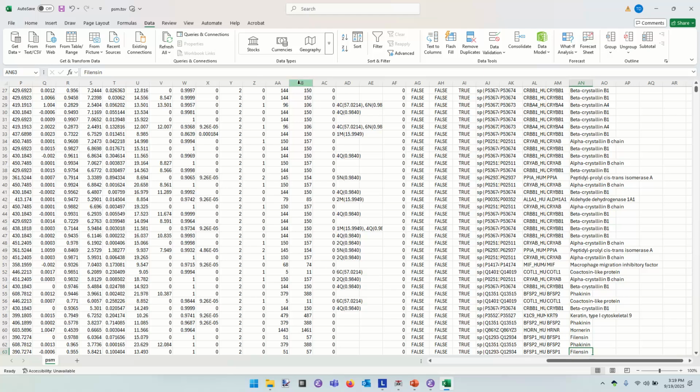Occasionally, it's good to use bog standard tools like FragPipe for doing basic sanity checks on the data. And an open search is not the worst way to accommodate the fact that you've got cross-linked peptides in the mix. When you do a cross-linking experiment, it's still very frequently the case that the great majority of the spectra you have represent either loop link or unlinked peptides.